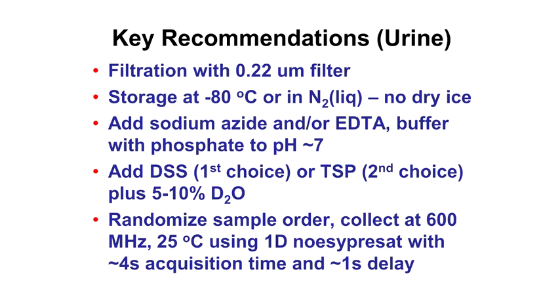Again, this is something that came out of a consensus, and not all of us agreed. Working at 25 degrees and using the 1D NOESY presat pulse sequence is the consensus. It works quite well. It's maybe not the best sequence in the world, but it's how most of the reference spectra in the world have been collected, and so you need to follow that. There's a typical standard acquisition time, a typical standard delay, and those are the things that you have to stick with. If you don't, then you will actually have some difficulties. So this is an attempt to standardize the collection of samples.